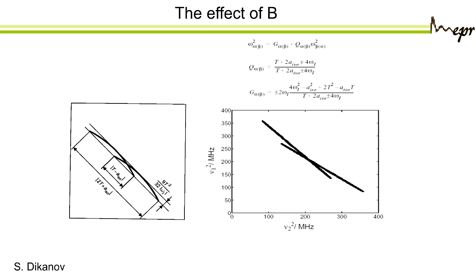Now there is a way, if you want, you can plot these HYSCORE spectra not as a function of the frequency, but as a function of the frequency squared, and if you do that, you get these straight lines, and up here on the right you get the equations, and if you look at this equation, you can derive from this the isotropic and anisotropic parts. I must say that this is not really used very often. People just look at the spectra that we see on the left, and then they just try to find this curvature.